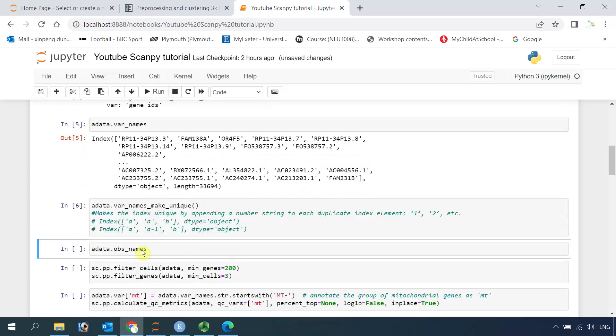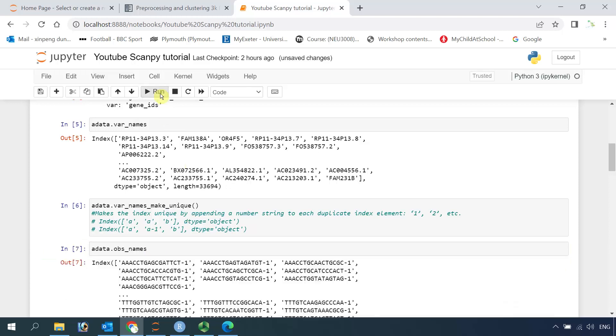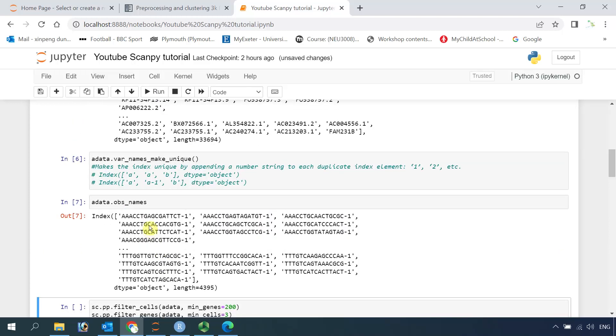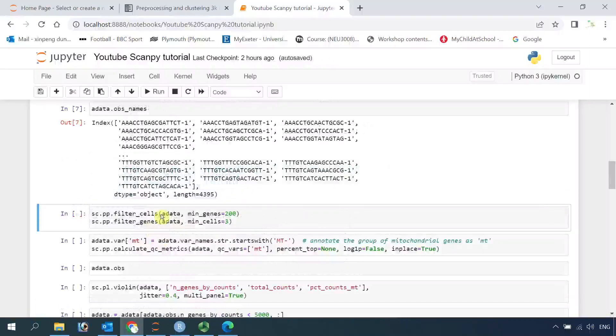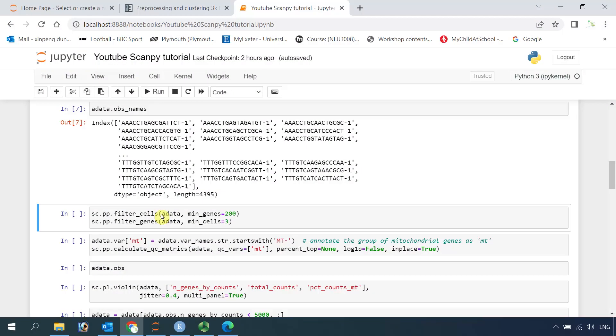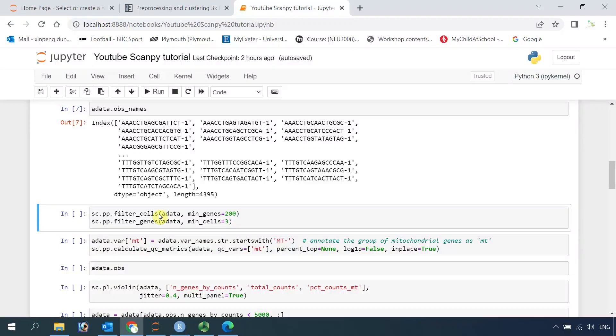Now we can have a look at the observation names, because the observation names are the barcodes. If we run this one, you can see all the barcodes in this dataset. If you watched my Seurat video tutorials, it will be very easy for you to understand the analysis using Scanpy in Python. Here, first thing we need to filter the cells. We will keep the cells that have minimum 200 genes, and also we filter out the genes that are expressed below three cells. So let's do the filtering.